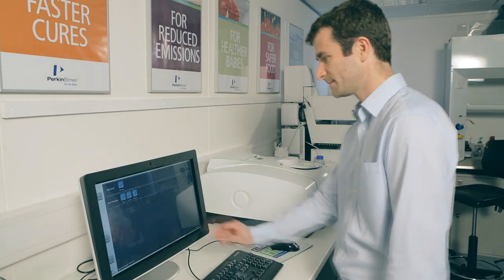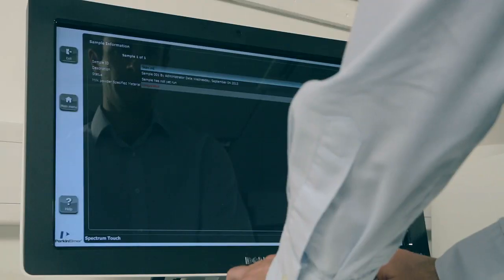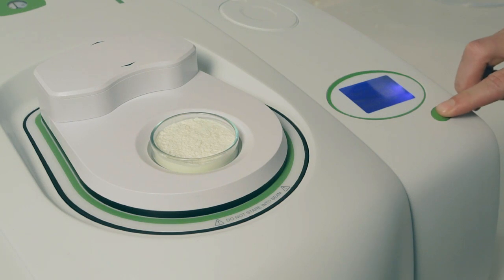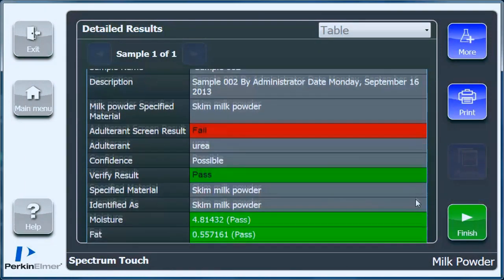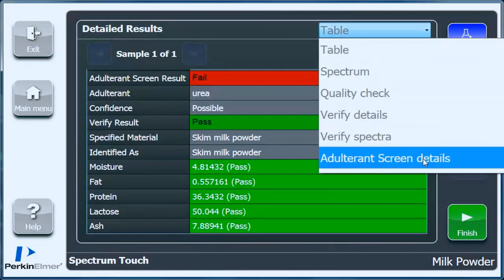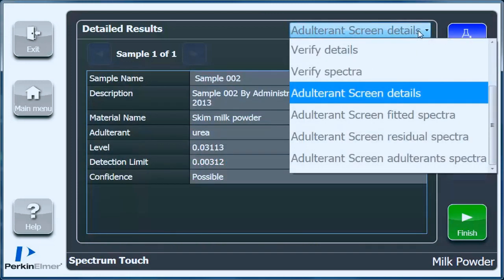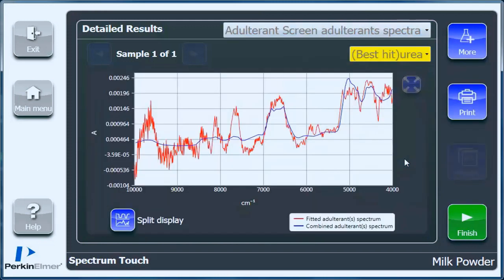So now let's run a second sample — one that we know to be contaminated. As before, we enter the sample information, place the sample in a petri dish on the instrument, and then press the go button. This time we see that even though the sample has passed on the nutritional metrics, it has failed because of an identified adulterant — in this case, urea. Our easy, rapid screening test by near-infrared has identified a potentially contaminated sample. At this point the sample would be sent for more definitive analysis, such as with the PerkinElmer AxION TOF-MS.